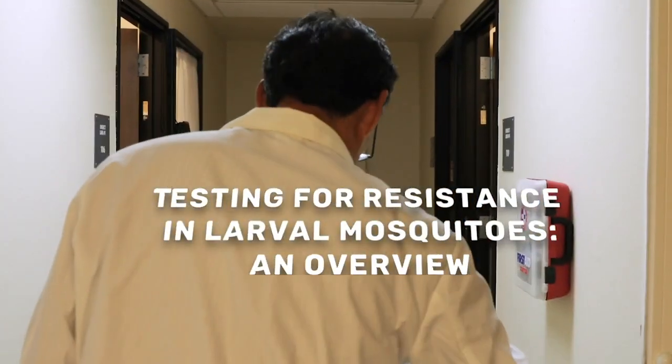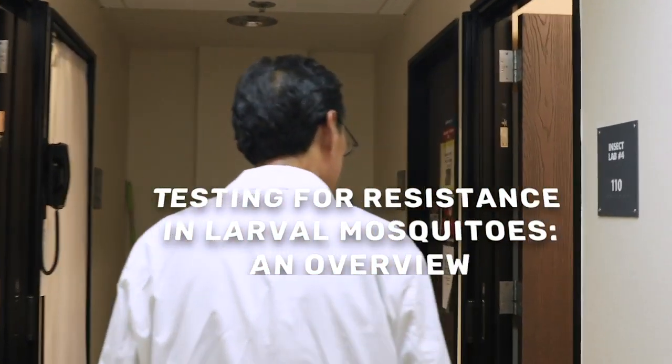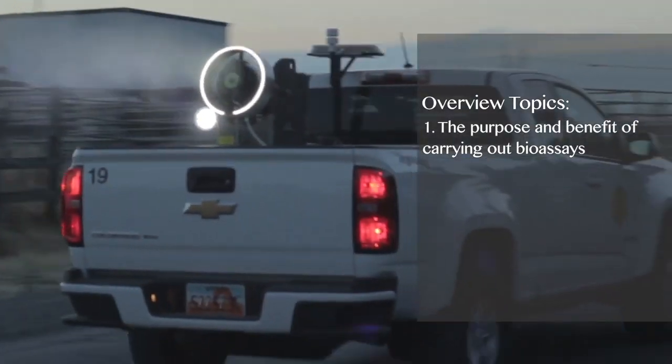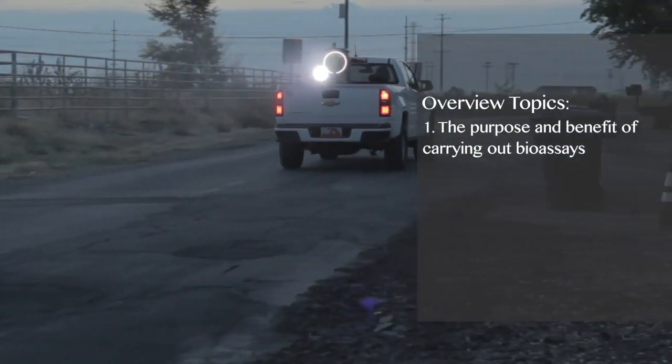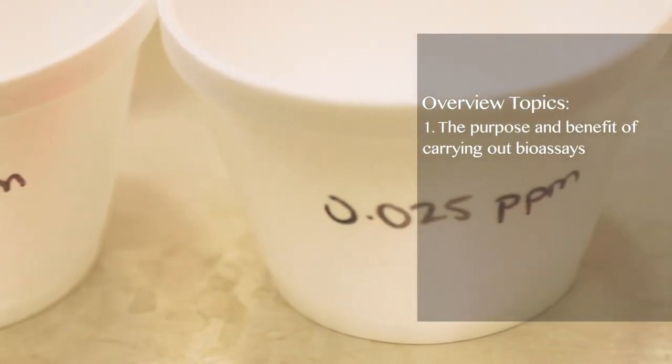In this video, we will cover the following topics. First, the purpose and benefit of carrying out bioassays. What information do you acquire about the efficiency and direction of control efforts in your mosquito control program?